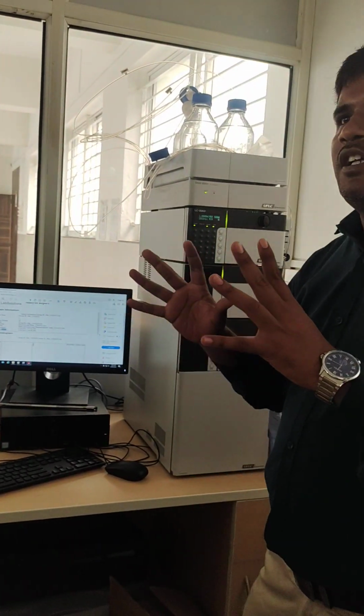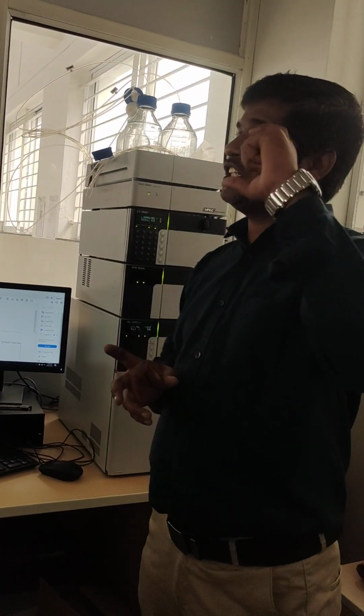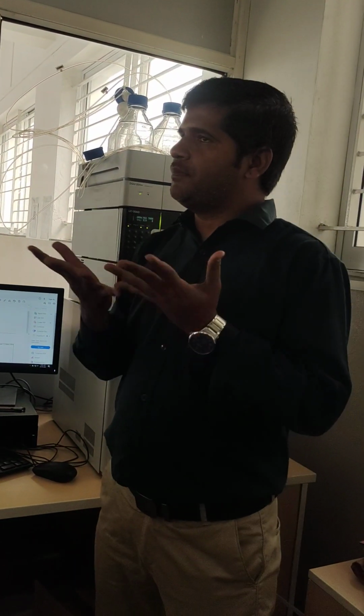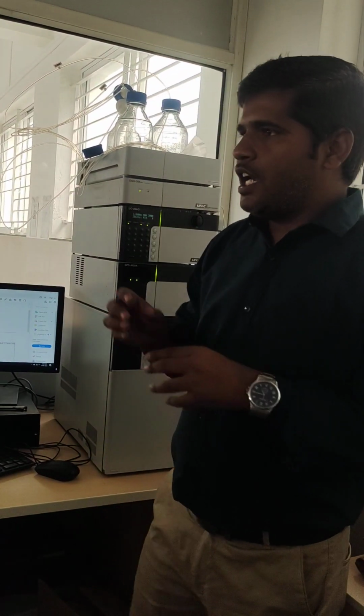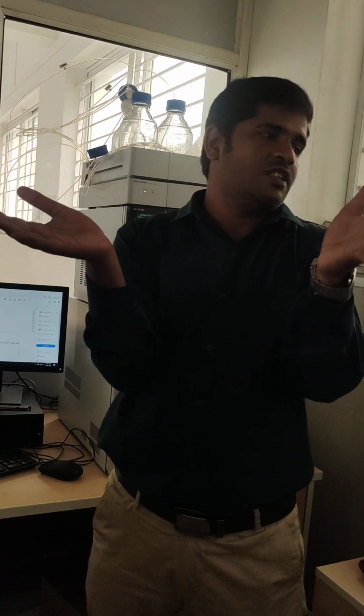Now if you want to create the method, what parameter we have to check, and how will you tell that this system is working and getting correct result? For that we have to check the system suitability parameter. What is that? System suitability parameter means what, and what is the need of that? System suitability parameter will check the accuracy of the instrument. Now one sample I have prepared, and I have prepared 5 injections.